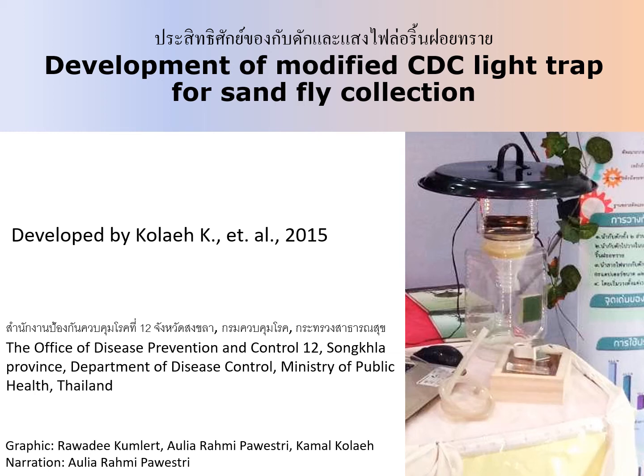Hi! Today we will discuss sandfly collection and share an interesting innovation on a modified CDC Light Trap that was assembled using materials that are easily found around us. Using this light trap, live sandflies can be collected and used for further colonization or Leishmania detection.